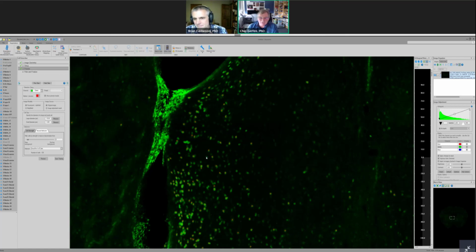However, there are still issues with, okay, well, there are some that are not labeled. And this gets back to the question about what do we do with FOS?